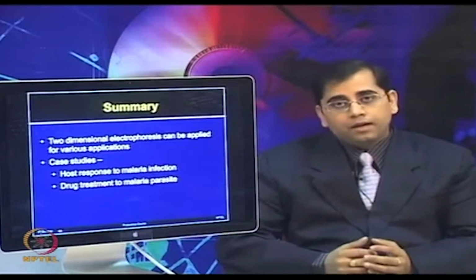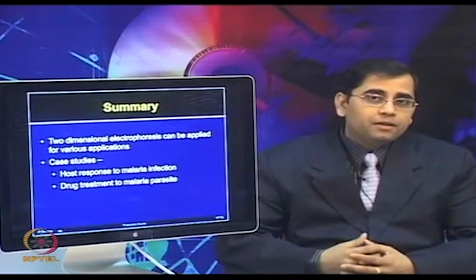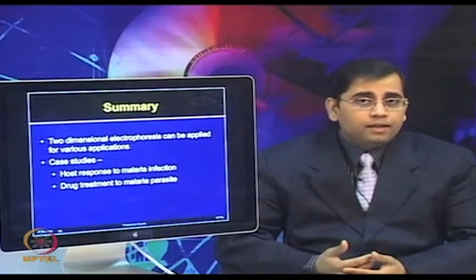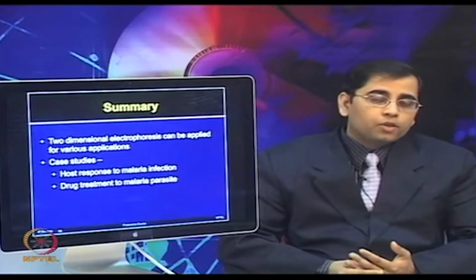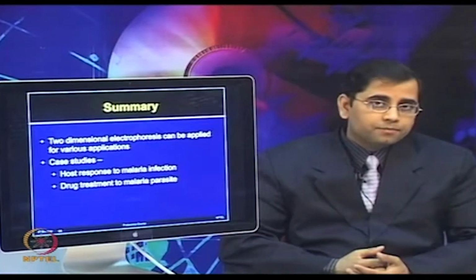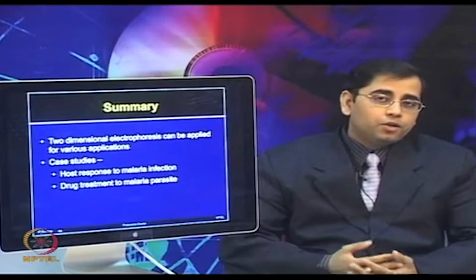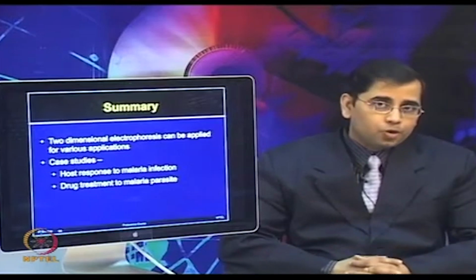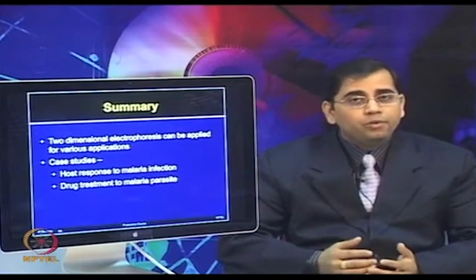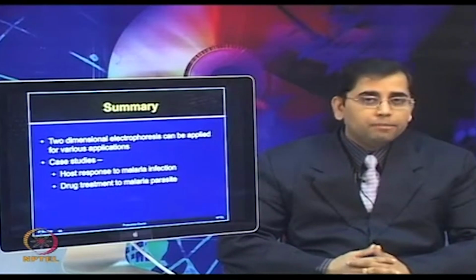If you can increase the overall proteome coverage, and can separate over 1500 to 2000 proteins on the gel reproducibly, then you have a good chance of identifying various potential targets, which could be novel drug targets or potential biomarkers. But if you have not done the proper quality control experiments, have not optimized the protocols properly and your proteome coverage is very poor on the gel, then you are comparing only a partial proteome, and there is a good likelihood that you will miss many important changes.